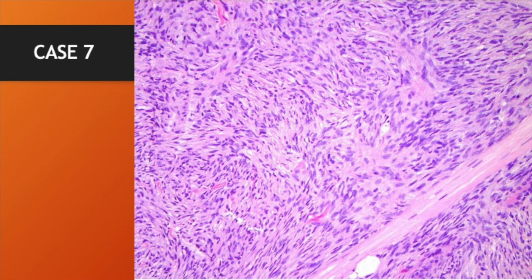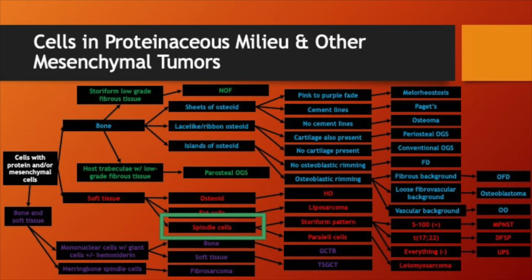The next thing is, are there fat cells? And what I mean by that is lots of fat cells peppered throughout here. And the answer is no, probably not. Maybe that's one way down at the bottom there in the middle. Hard to say, but that could just be a blood vessel as well. And that's most likely what it is because there's a couple of nuclei surrounding that. So it could be confusing, but we're looking for lots of fat being peppered throughout this, and we just don't see that. So what we have is lots of spindle cells running throughout here. So that's what we see. That's where we're going to go with this.